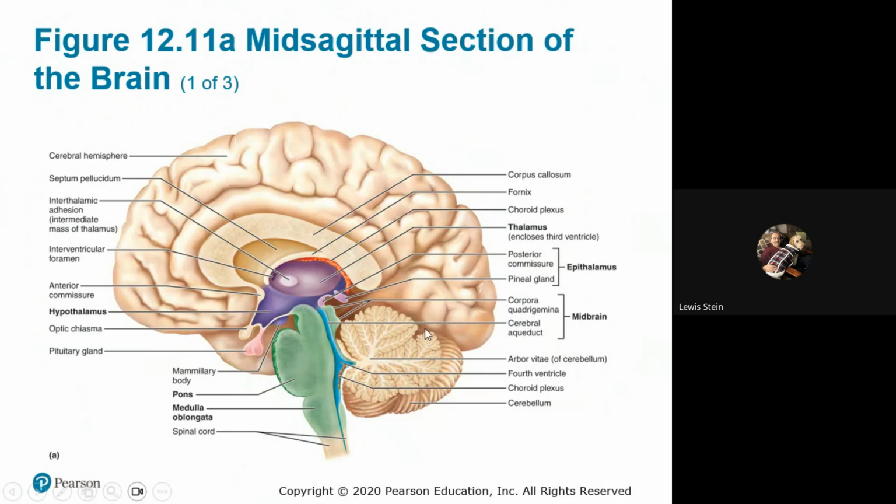Before you cut in there, if you separate the occipital lobe from the cerebellum while they're both intact, you will see this protruding. It looks like a little pine cone. They named it the pineal gland. It's part of the endocrine system. We still don't know what it does, other than make melatonin. So it obviously has a role to do with sleep.